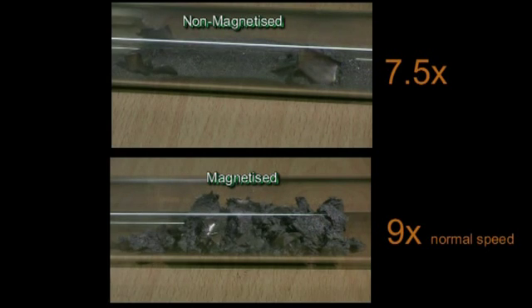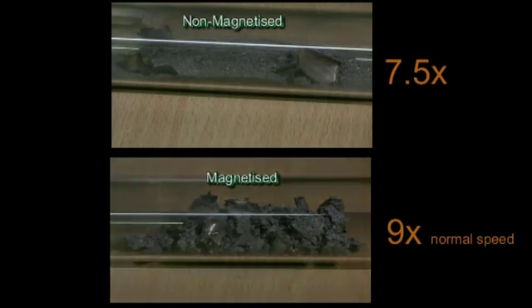The metal hydride produced from both samples is very easy to turn into a finer powder by process, for example milling, as the hydride powder generated is very brittle.